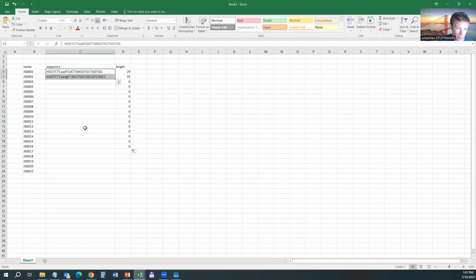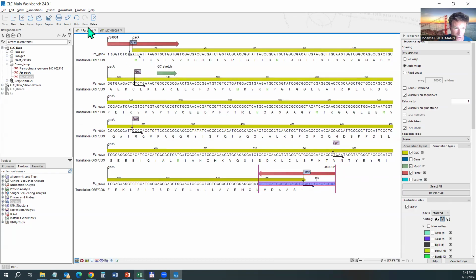31 nucleotides. So this would be like a PCR product, yeah, if I want to really clone this. There may be a command to directly make PCR products, but I'm not aware of it. So when I do primer design, I more or less do it like this.